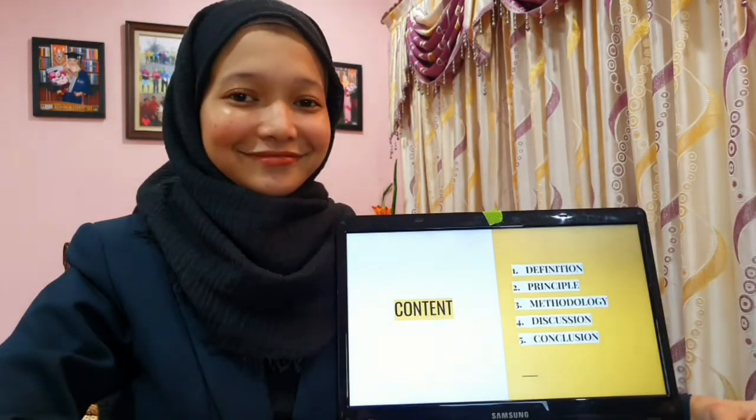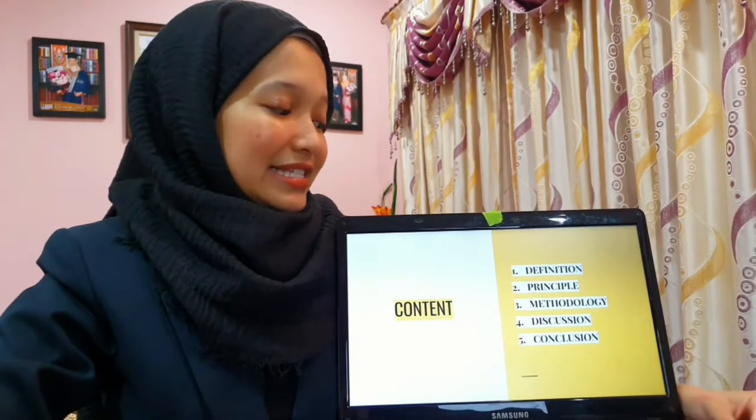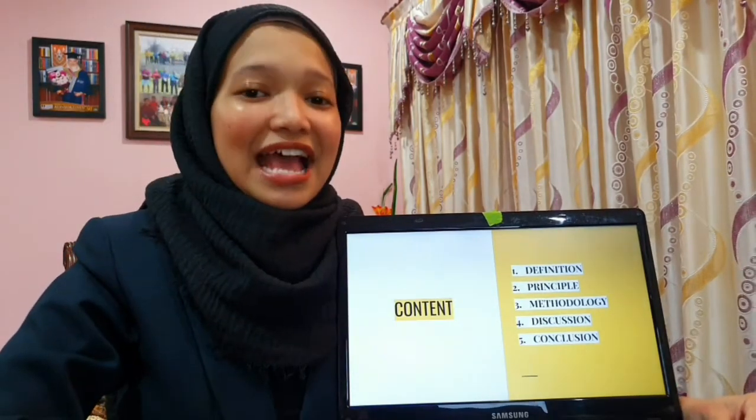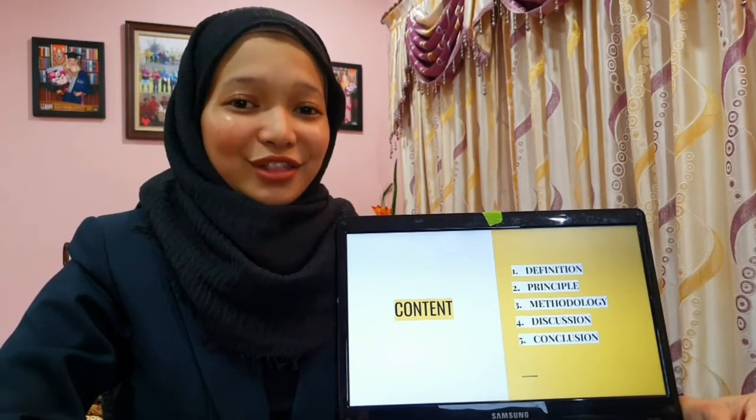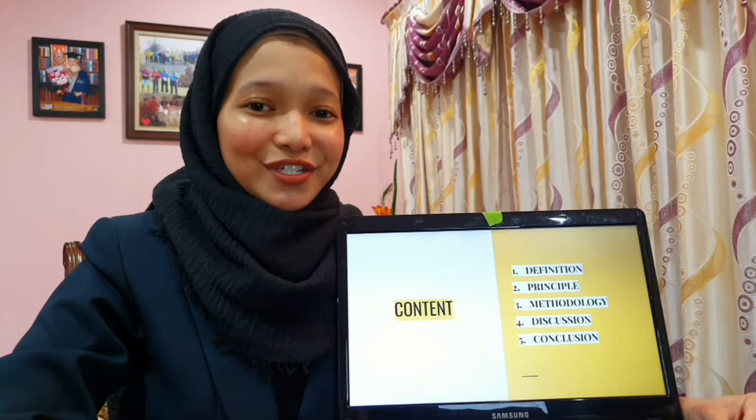I am going to present our lab report 3, which is the determination of iodine value by using Wijs method. The content of my presentation video is first, definition, second, principle, third, methodology, fourth, discussion, and fifth, conclusion.